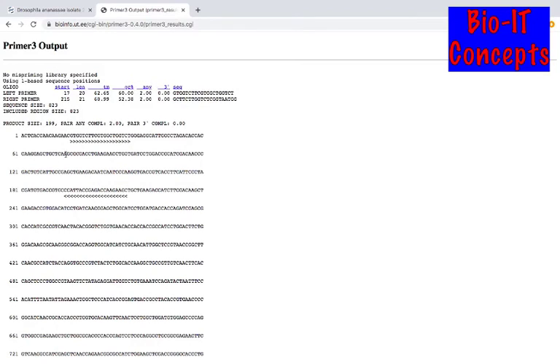It is the left primer and it is the right primer. This is the length of our primer. This is the TM. Remember, both TMs should be approximately nearby. Okay, GC percent is also okay. Complementarity, 3' complementarity is also okay. Now this is the sequence of primer we get. Okay, this is the product length, and this software is available online.